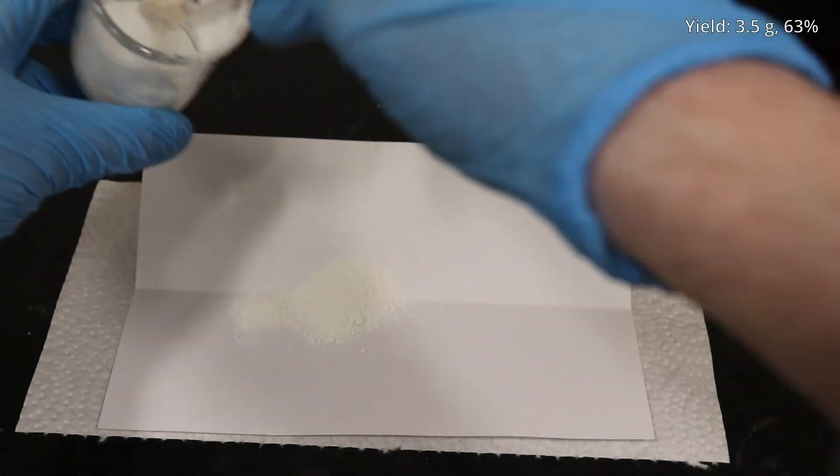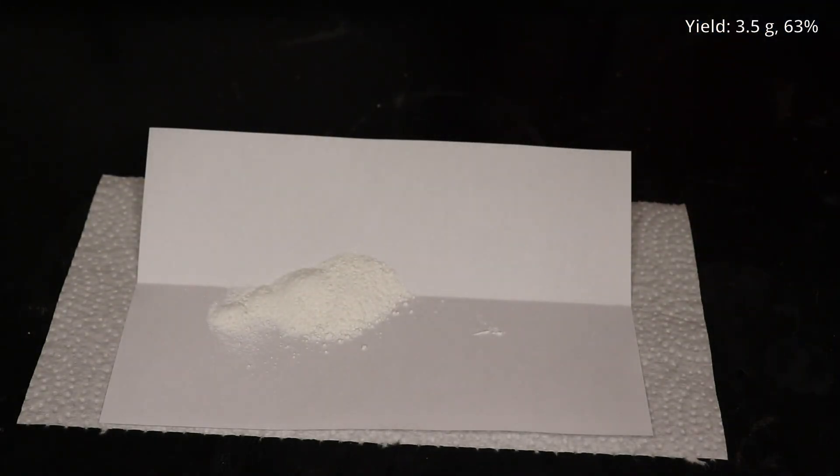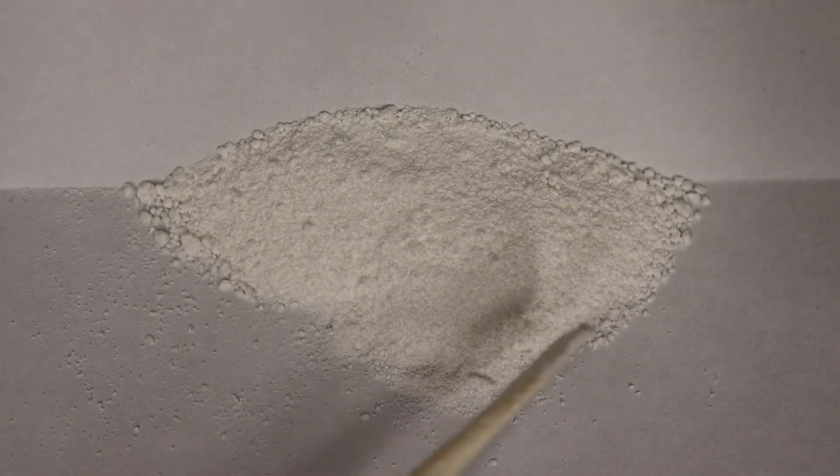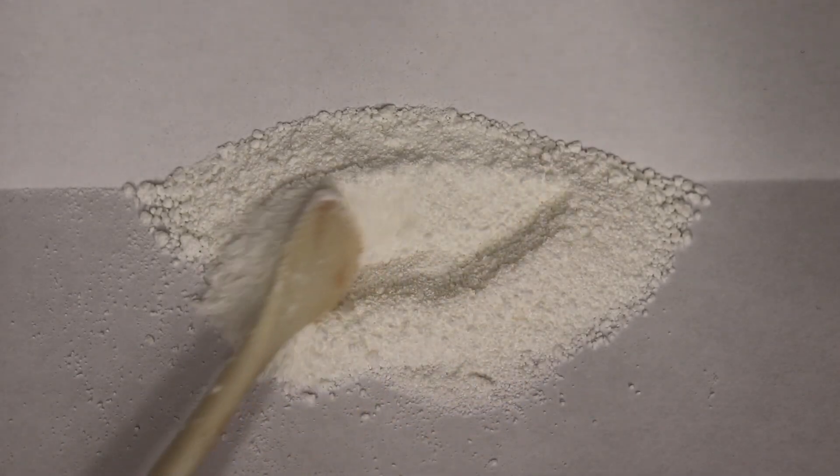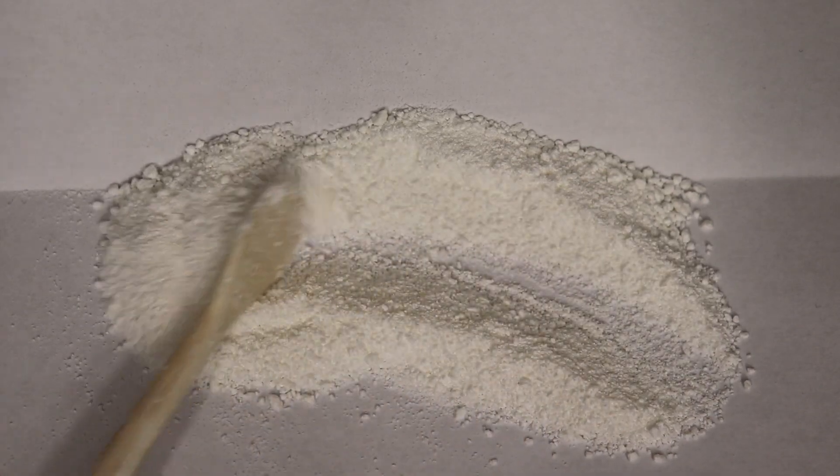A total of 3.5 grams of cholesterol acetate was obtained as a fluffy white powder. This corresponds to a 63% yield, which is lower than one would hope. However, most of the yield loss was likely during all of the washing steps, which in the end would contribute to a higher purity product and a lower yield.